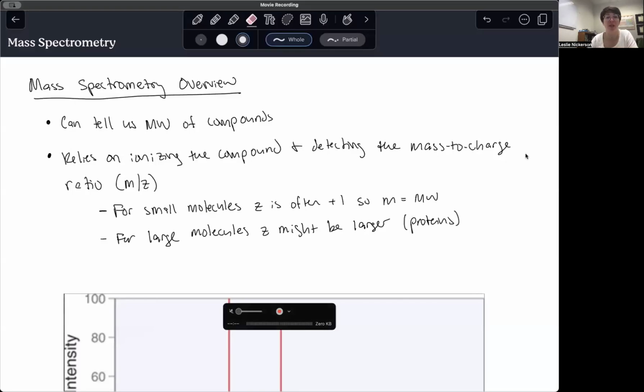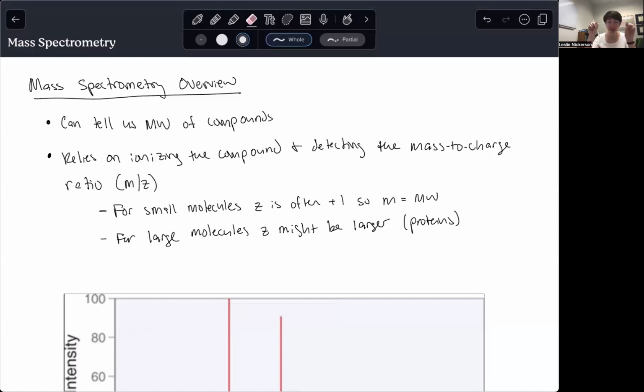Everybody, I'm going to talk about mass spectrometry in this video. So keep in mind, this is going to be a very broad overview of using mass spectrometry in terms of product analysis, like unknown determination type of things. Mass spectrometry is a very, very large subject. It's got a lot of little intricacies in it. So we're just going to be doing a very, very surface level look at this. So don't use this video as that if that's what you're needing.